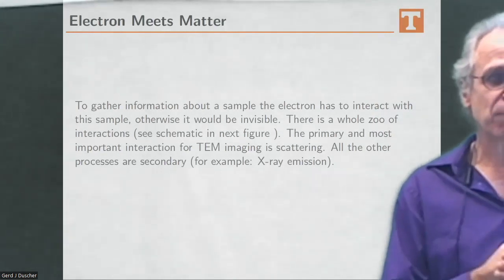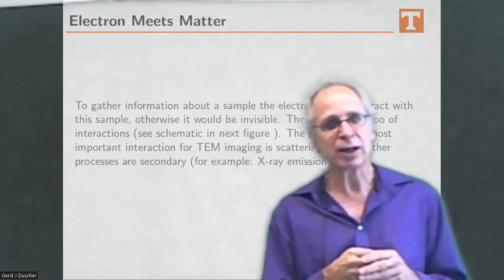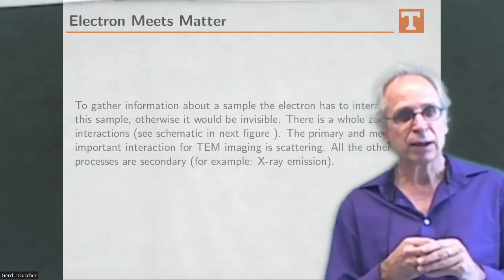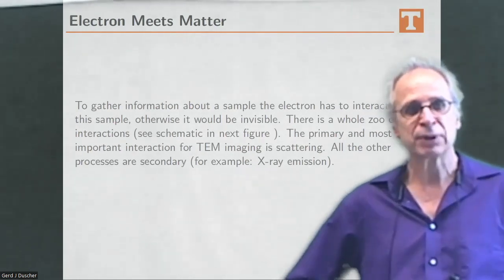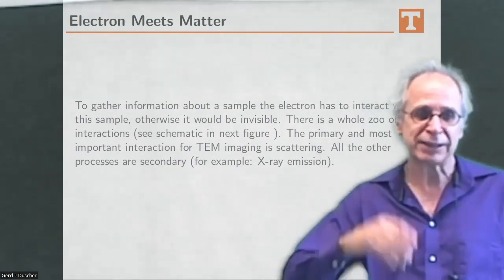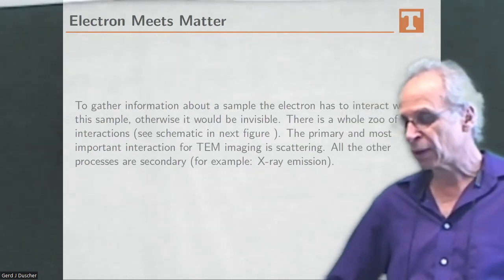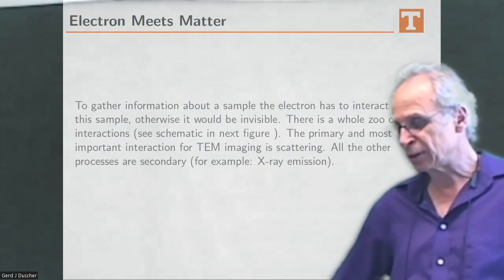Electrons interact much, much more strongly with matter than most other particles, or at least better than any kind of photons, so X-rays or neutrons specifically.